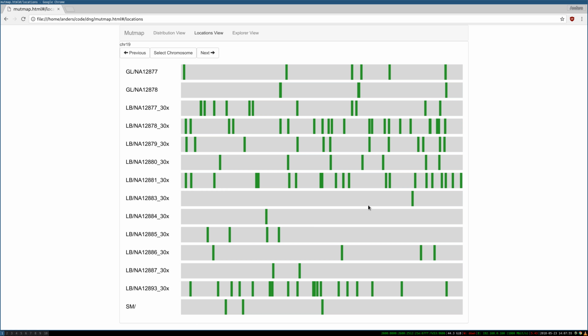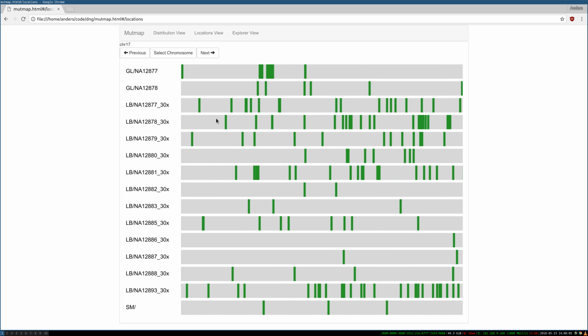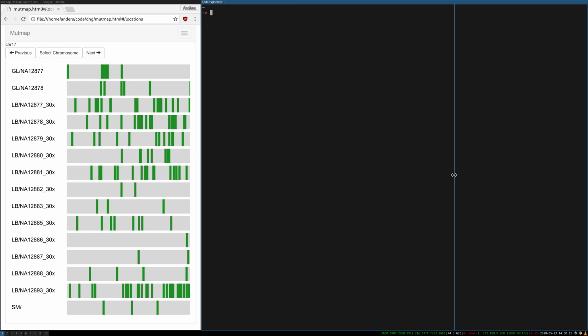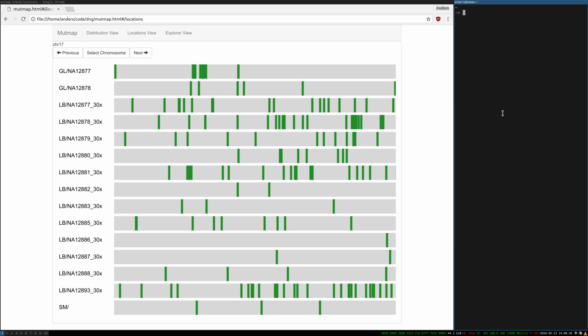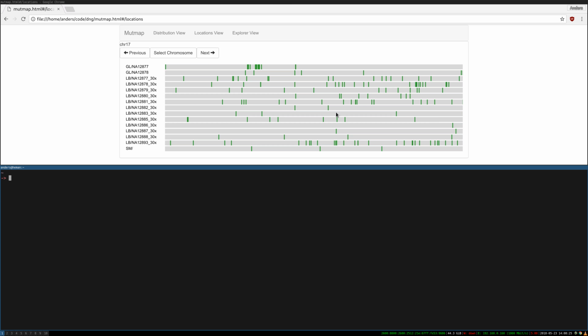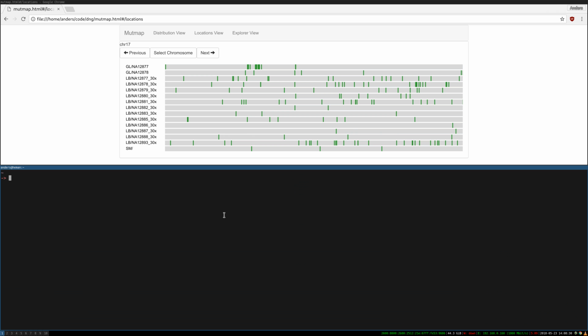Or you could imagine other sort of interactions like that. But for now, this has limited usability, although we did use this as a way to develop, making this very responsive. So this view is nice because as you resize it, everything automatically updates to be responsive in terms of the layout and sizing of everything, which is pretty nice.